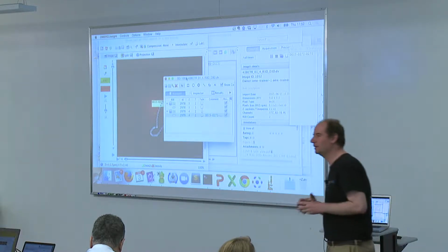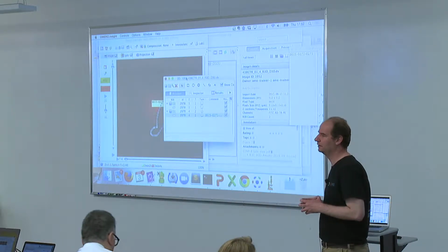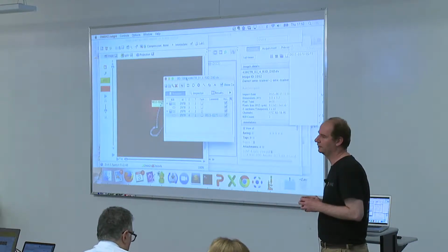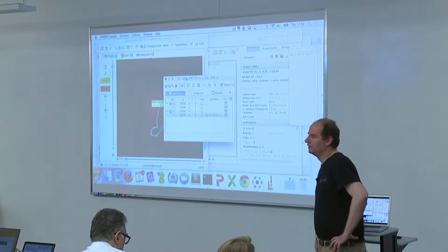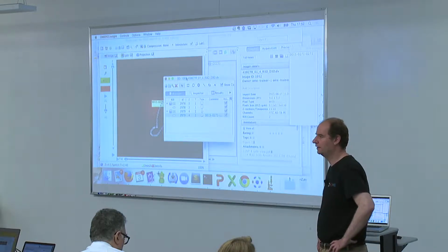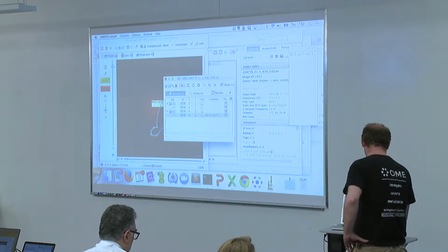Yes. And along the same lines, when you showed us how you could relabel the name of the channel, you said you're not overwriting any data, you're just adding. How would you look at the original metadata that was there versus what you added on top? Okay, there is just a clear tab for that.